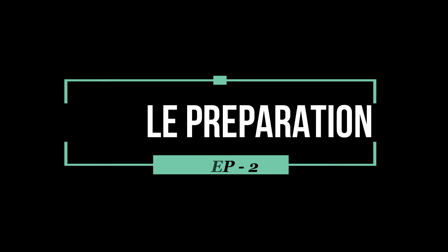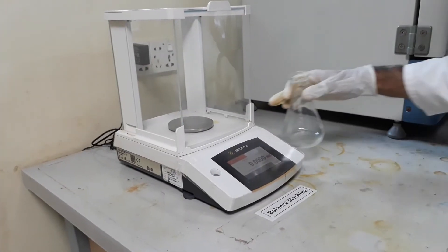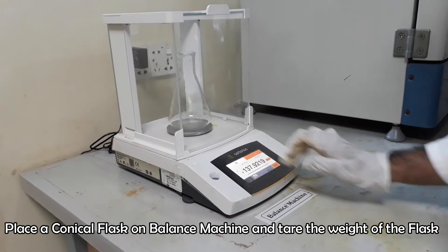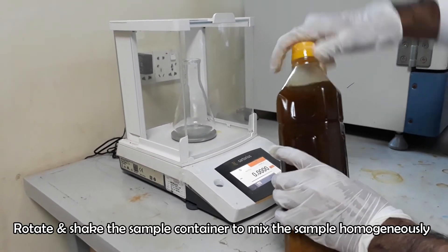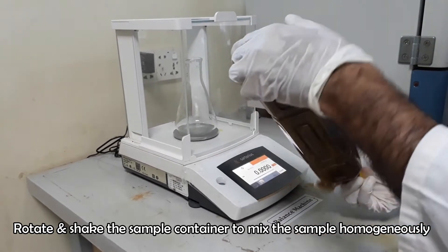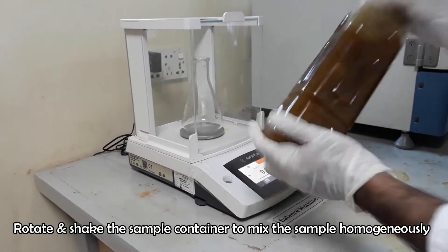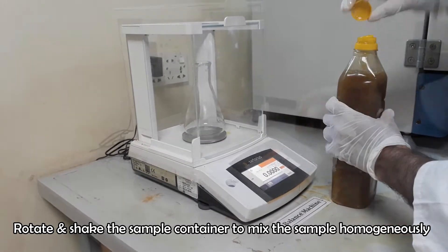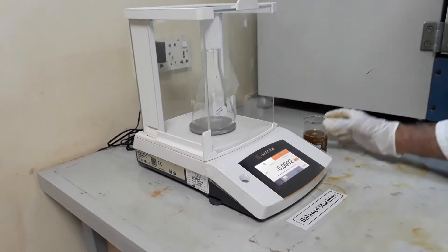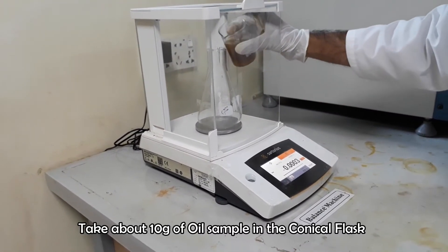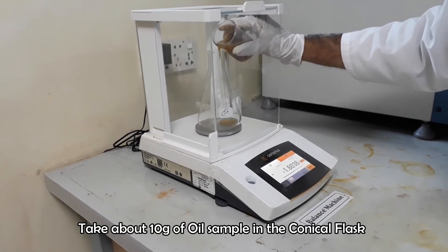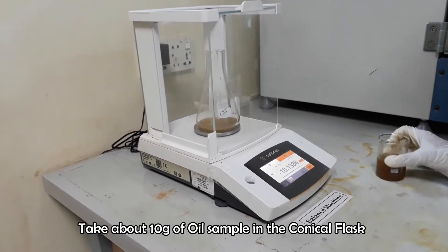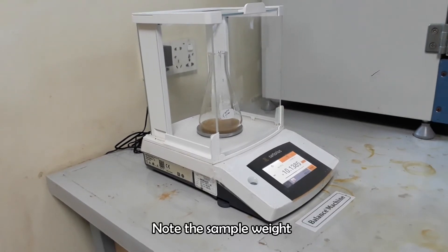Now we will prepare our sample. Take about 10 grams of oil sample in a conical flask. Note the sample weight.